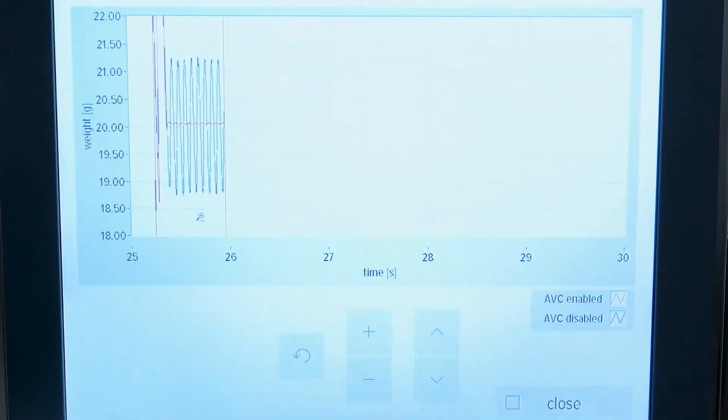Ambient conditions are not always perfect for fast, precise, and accurate weighing. Disturbances in the building or in the machine can lead to false weighing results. Our solution: AVC — Active Vibration Compensation. We measure the vibrations and filter them out from the weighing results without loss of throughput or accuracy. Here we create vibrations to demonstrate the performance of AVC.